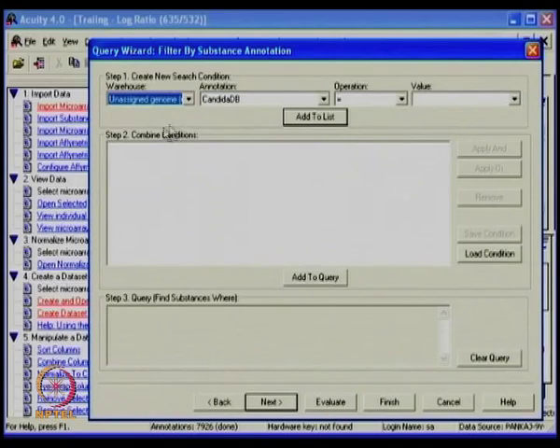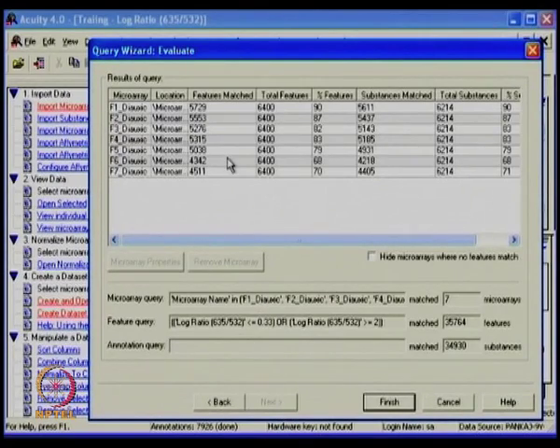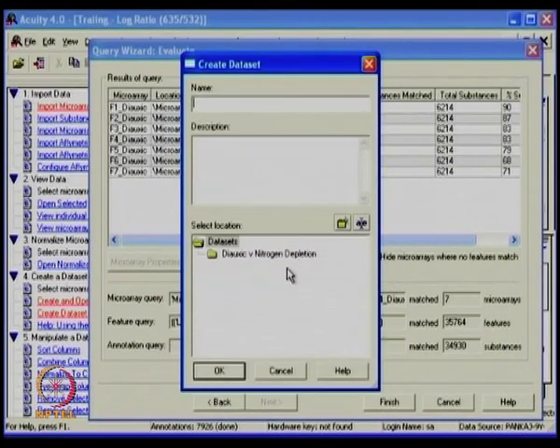You can even select the database on the basis of annotation and filter only for mitochondrial specific ones. So it depends on what questions you are asking. Quickly look at only what you are interested in. It says how many of them are there in that, so it reduced the numbers. In this fashion, I can import a limited number of the database as well. I can give a name to it, like filtered, and it will be imported.